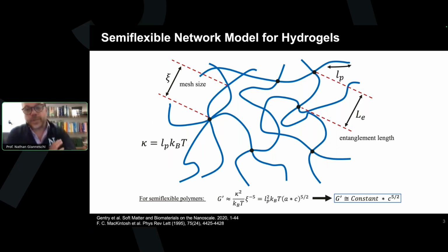As I said, the topic for today will be our efforts directed towards capturing a real space image of these kinds of network architectures, for which there are all kinds of different models that describe how the bulk properties of a gel, in this particular case a hydrogel, are determined by, or perhaps predicted if you were to know, these different pieces of architecture.